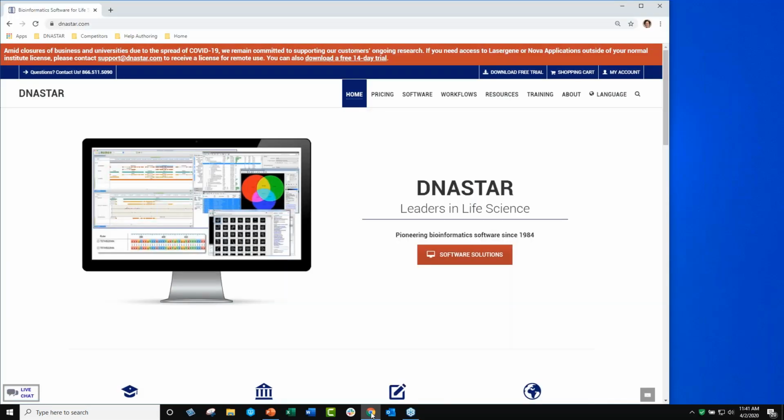So I'm going to be presenting our final segment today. Again, I'm Sharon Paige. I'm DNASTAR's Senior Content Developer. I've been with DNASTAR for, I think, 16, 17 years. I write most of the help, user's guide, tutorials, and I make probably a good half of the videos. So you've probably seen my work, even if you don't know me. And hopefully you are consulting the help when you need help. We have a great support team in place.